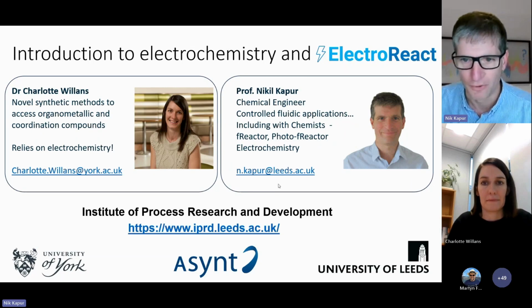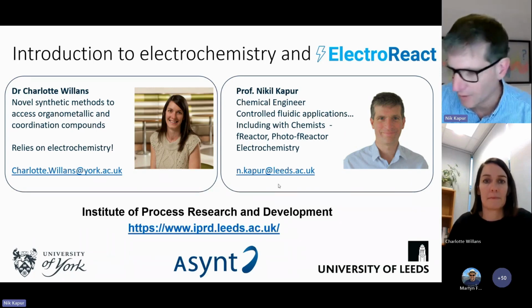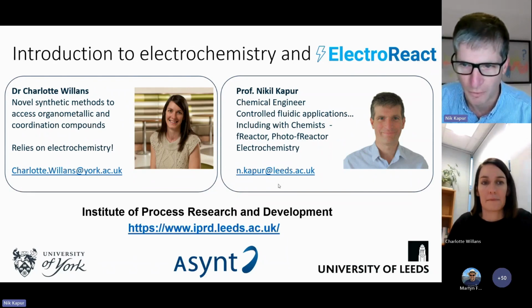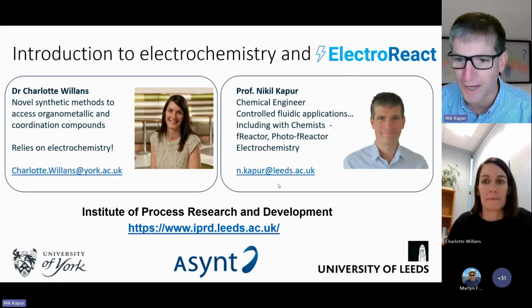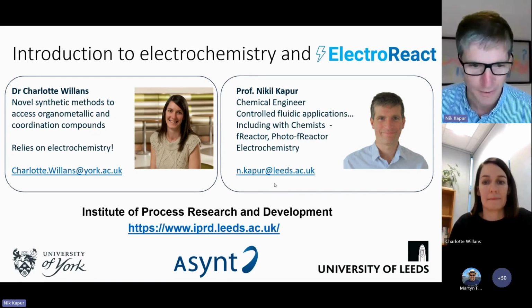So by way of introduction, my name is Professor Nick Kapur. I'm a chemical engineer. I work at the University of Leeds, and much of my research is around creating very controlled fluidic applications. These include work with chemists. So we've developed the Freactors, which is a flow chemistry platform with Asynt in the past, and then added on the photochemistry element to that, so the photo Freactor. And I've worked with Charlotte for probably about a decade now. Part of the work we've done is about creating a really robust electrochemistry platform, the Electro React, that we'll talk to you about today.